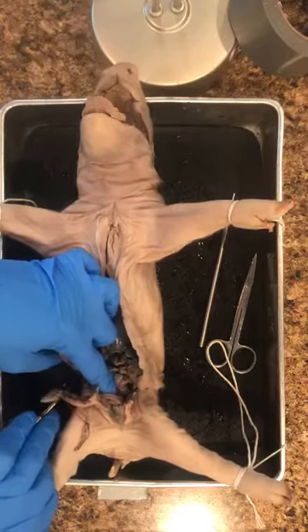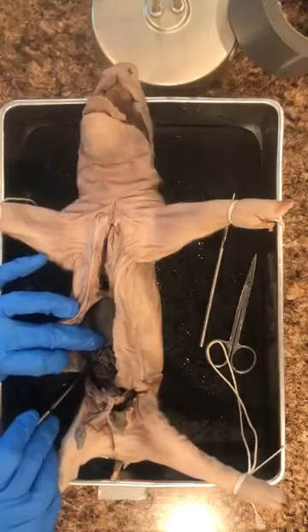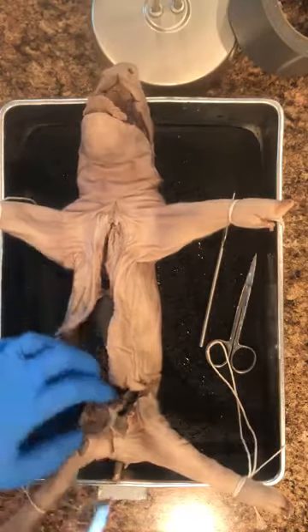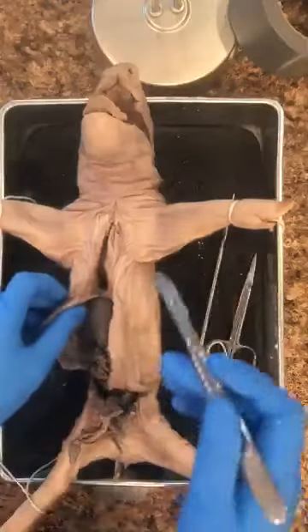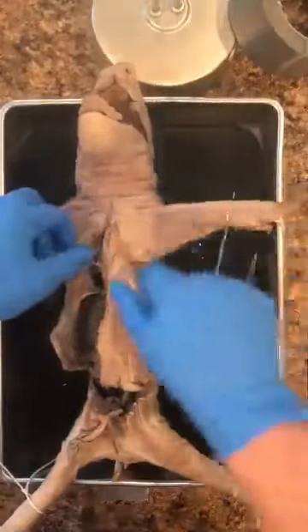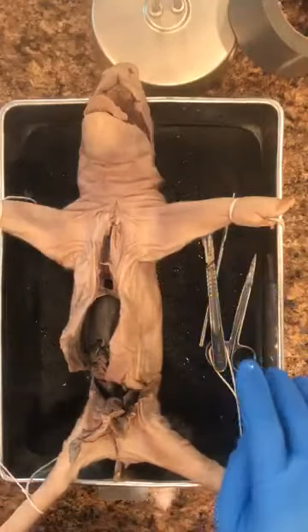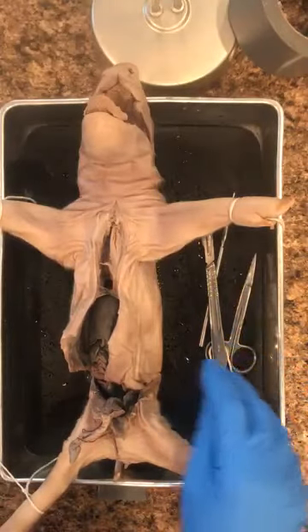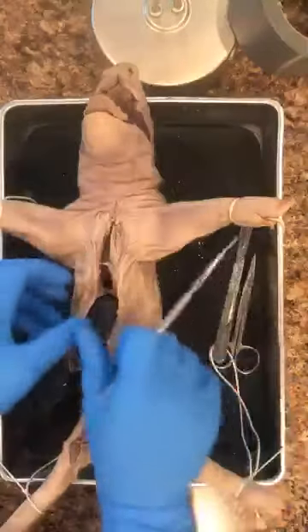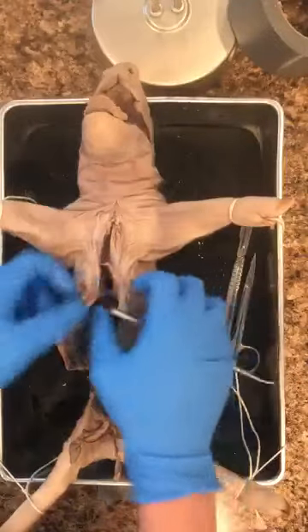This cut down. This takes the longest, is opening this up here, and then we'll be able to talk through all the organs that you see. Okay, something else. So as you open up the pig, you'll be able to notice quite a few things. It is stuck together right here.